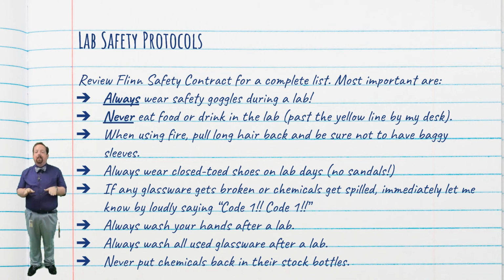Do not try to pick up broken glass on your own. I'll take care of it for you. Even if you don't think you got any chemicals on your hands, it's best to always wash your hands thoroughly with soap and water after the lab. There's hand soap at each sink available to you. You'd be surprised how much stuff you can get on your hands without realizing.